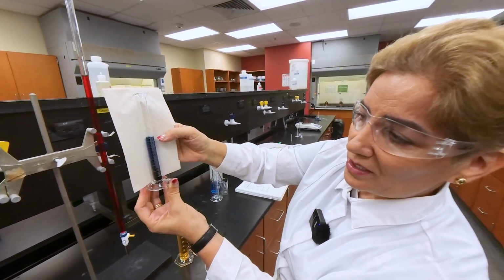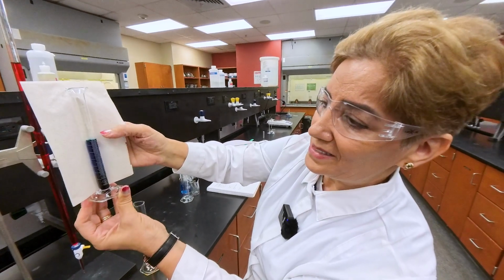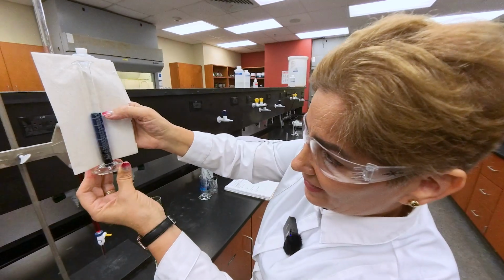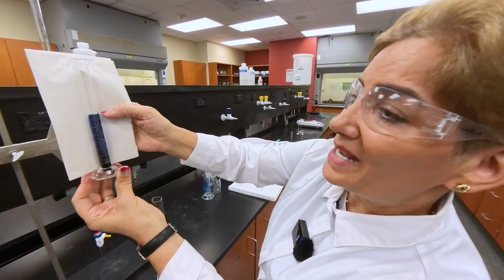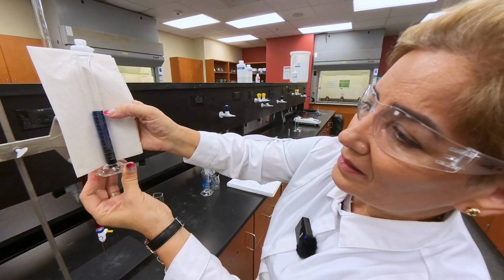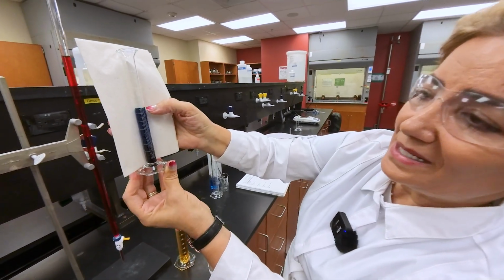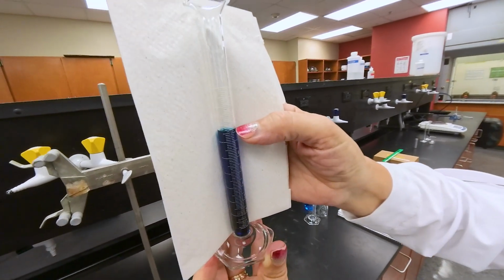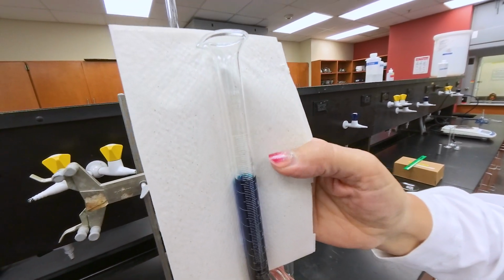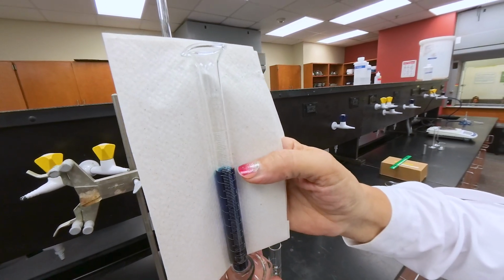So it's not going to be recorded as less than 7.5. It will not be recorded as more than 7.6. It's between 7.5 and 7.6. And the last digit has to be estimated. How do you estimate that? You mentally divide the space between 0.5 and 0.6 by 10, and then see how high it is compared to 0.6 or how close it is to 0.5. That's what you are looking for. We are looking for the level of the meniscus to be matching exactly what level.